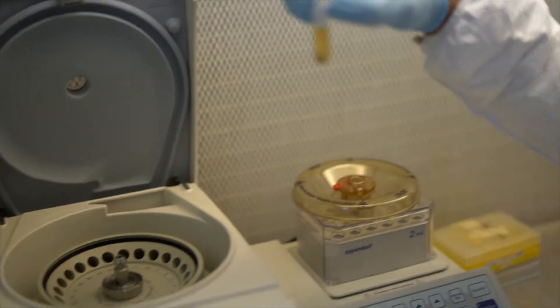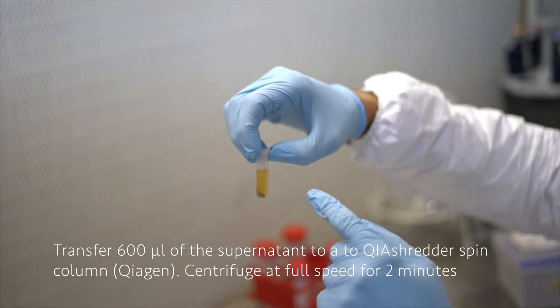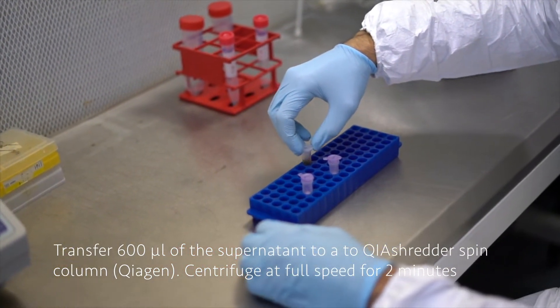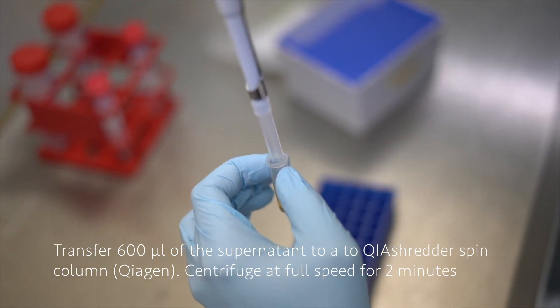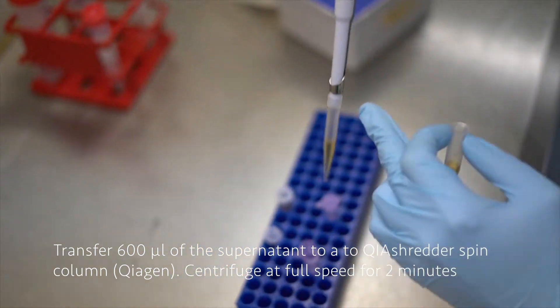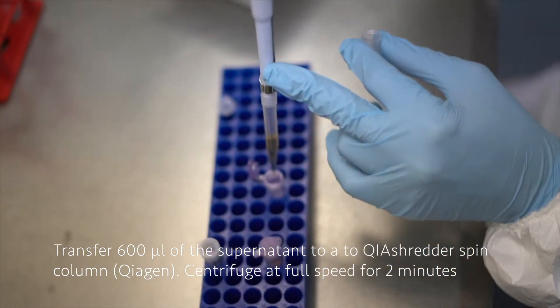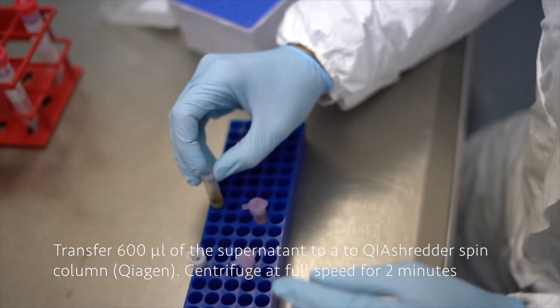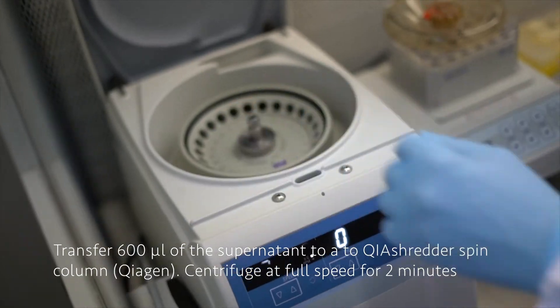Now the centrifugation is ready, we see there is like a sediment and a supernatant. We have then to pass the supernatant through a shredder column of the Qiagen kit, and this has to be done in two steps each with 600 microliters. Now we have to centrifuge it at full speed for two minutes.